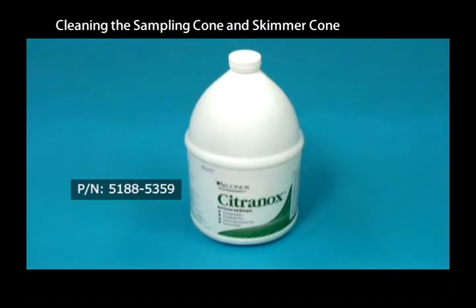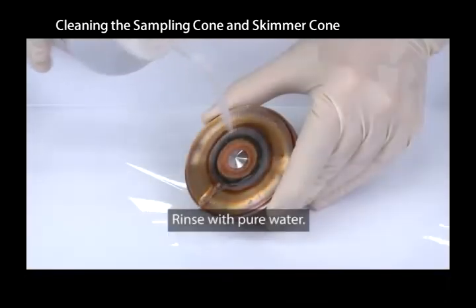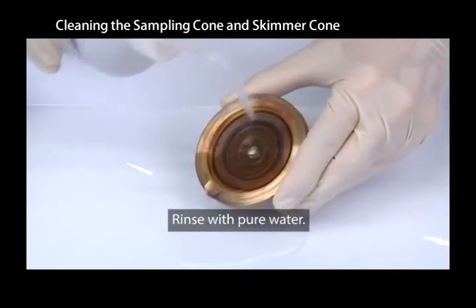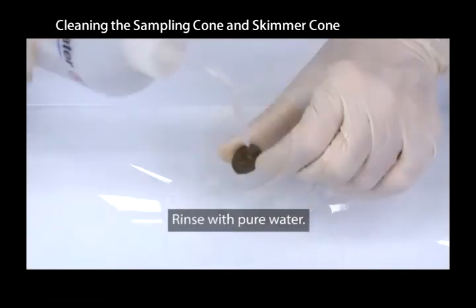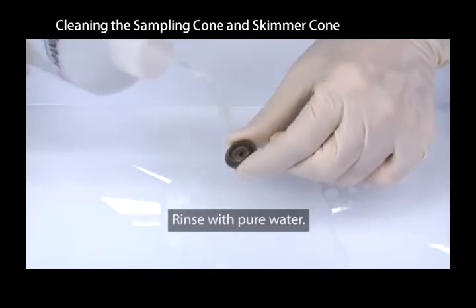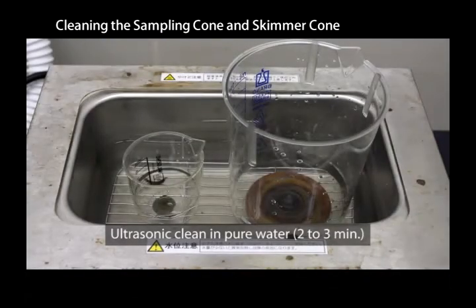Use citronox solution for step two. Use an ultrasonic bath to clean the cones in 2% citronox solution for two to three minutes. Rinse with pure water. Use an ultrasonic bath to clean the cones in pure water for an additional two to three minutes.